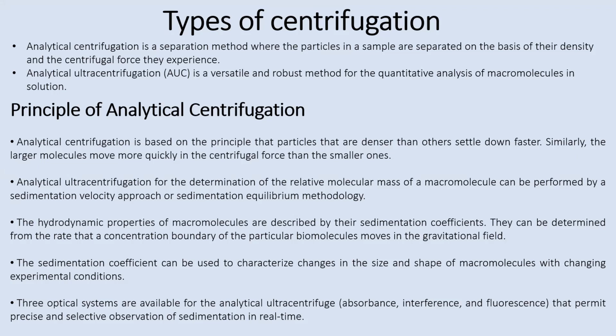So what if the experimental conditions are changed? Suppose you have a biomolecule in an aqueous suspension, like a proper buffer system. Obviously the size and the shape of the macromolecule will probably be at their optimum. But if the same macromolecule is subjected, say, to a solvent, now things might change. So when you change the experimental condition, the sedimentation coefficient may also change. So you can use the property of sedimentation as one of the characterization studies for that particular macromolecule.